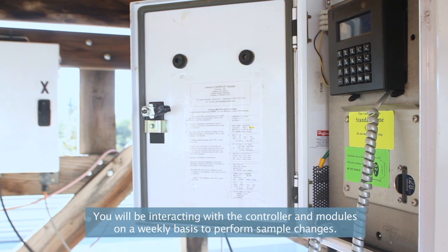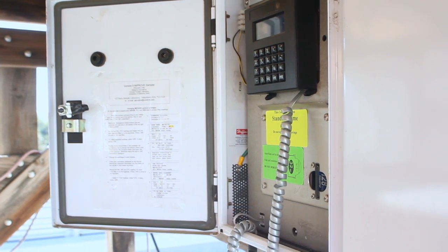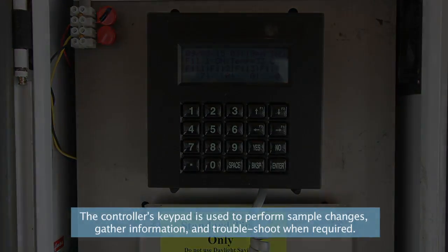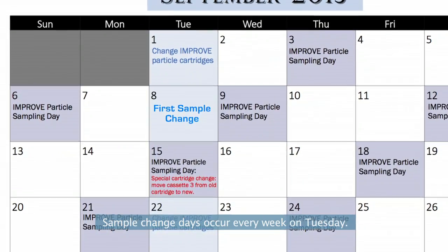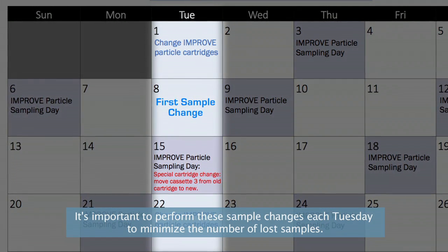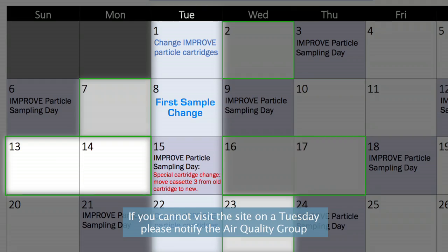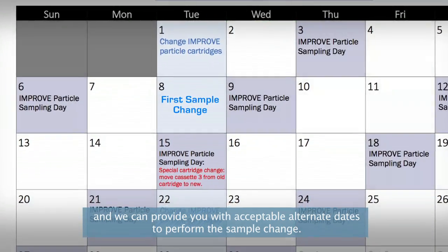You will be interacting with the controller and modules on a weekly basis to perform sample changes. The controller's keypad is used to perform sample changes, gather information, and troubleshoot when required. Sample change days occur every week on Tuesday. It's important to perform these sample changes each Tuesday to minimize the number of lost samples. If you cannot visit the site on a Tuesday, please notify the air quality group, and we can provide you with acceptable alternate dates to perform the sample change.